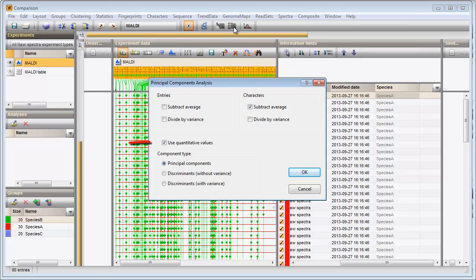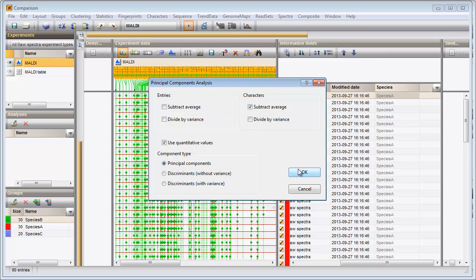I make sure MALDI is selected and I choose this button. By default, Use quantitative values is checked. If this option is unchecked, the binary information will be used. Subtraction of the averages over the characters results in a PCA plot arranged around the origin. Therefore, it is recommended to check this option for general purposes. I press OK to start the calculations.